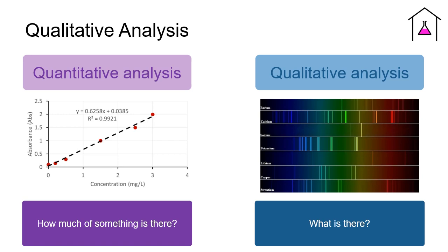Now this dataset is actually turpentine dissolved in hexane, but that hexane contained a lot of alkane contaminants. And in this video, I'm going to show you how to find these alkane components in a complex GCMS sample. And then your task will be to use the same approach in order to identify the monoterpenes in this dataset, a different class of chemicals.